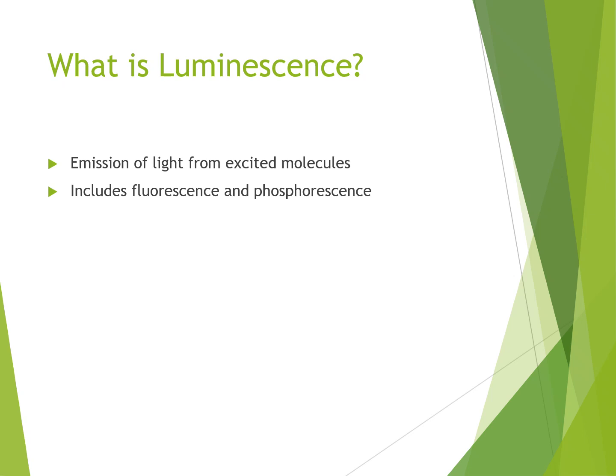Luminescence takes place when light is emitted from excited molecules, not from heated molecules. So without heating, the luminescence process takes place, and it occurs when excited electrons return to their lower energy level.